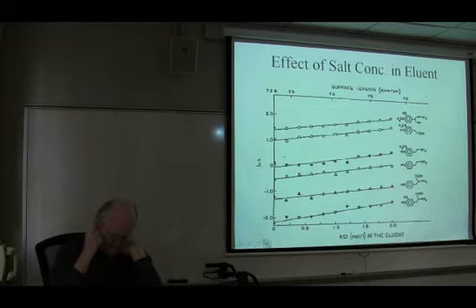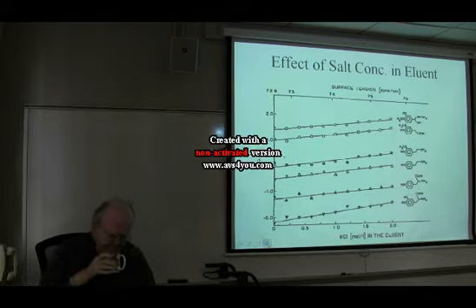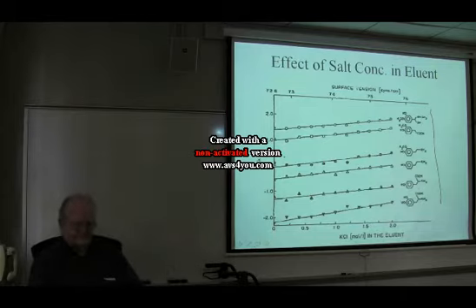Okay, moving on. Here's the effect of salt, specifically potassium chloride, on a whole bunch of essentially neutral compounds.